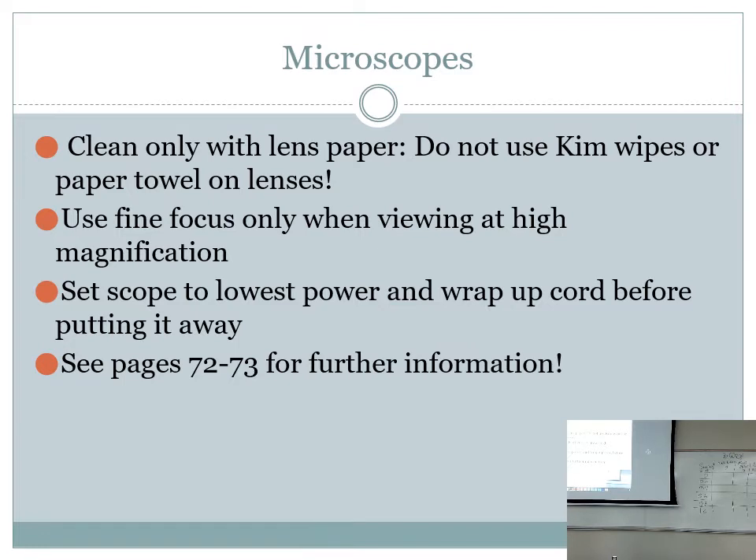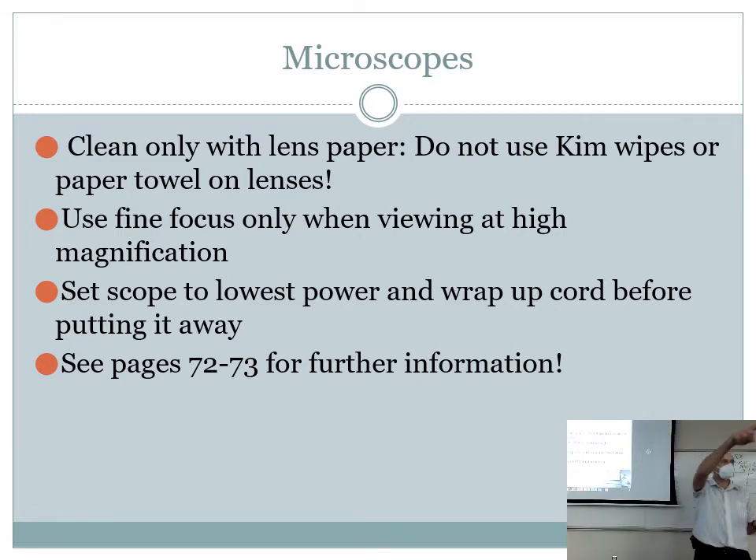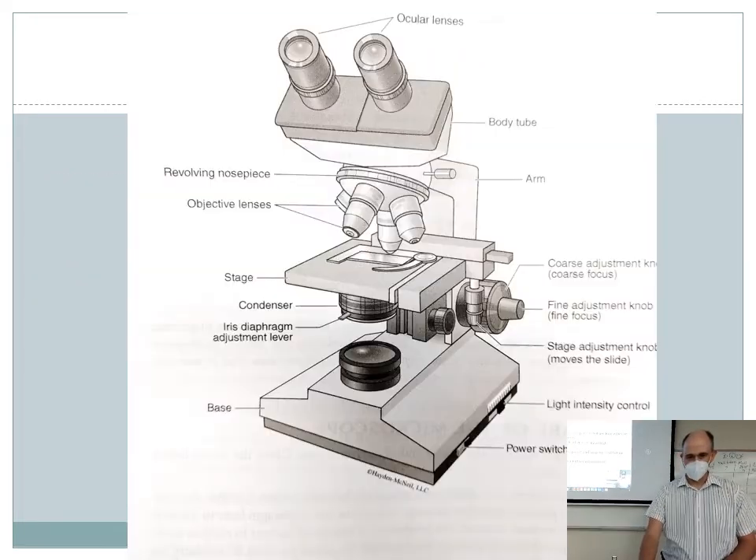When you go to high magnification — the highest we use is the 40x objective — only use fine focus. When you're done with the scope for the day, wrap the cord up so people aren't tripping over it. I'll have you leave the scopes out on the bench since they're used all week long. There's also a set screw on your scope — always make sure that's tight and never mess with it, because students sometimes loosen it and pivot the head around, and if that head falls off it's about $1,800 in parts.